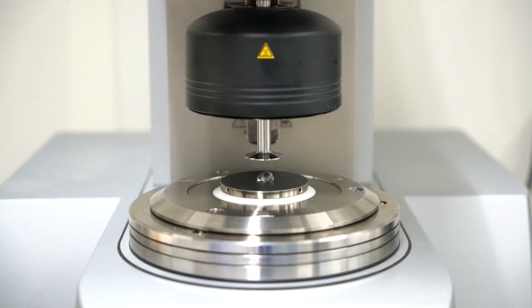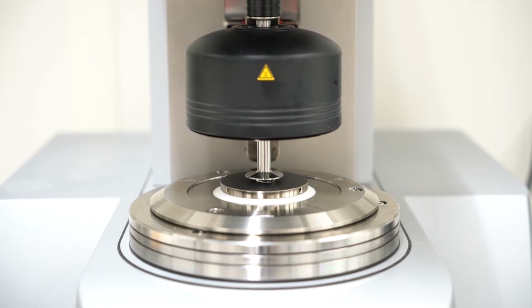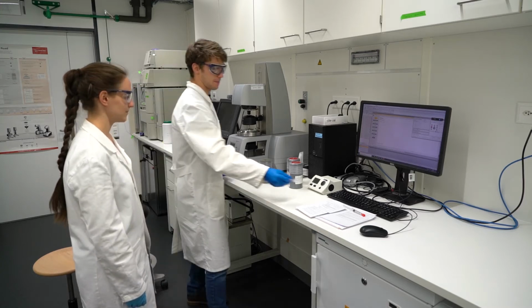At this point, we can pull down the geometries and work at a specific distance of 0.105 millimeter. Okay.